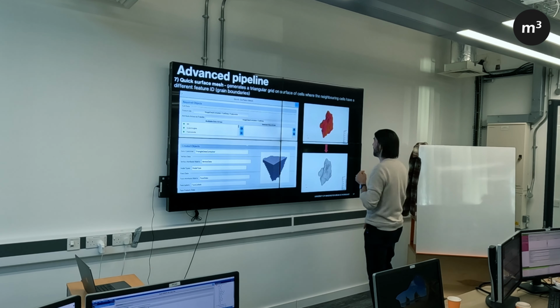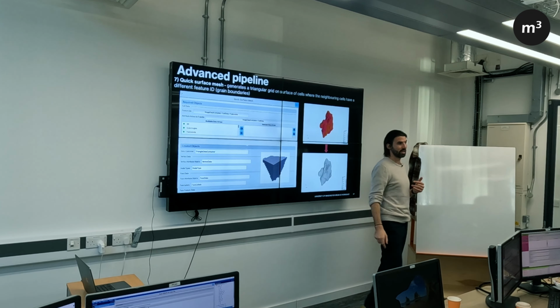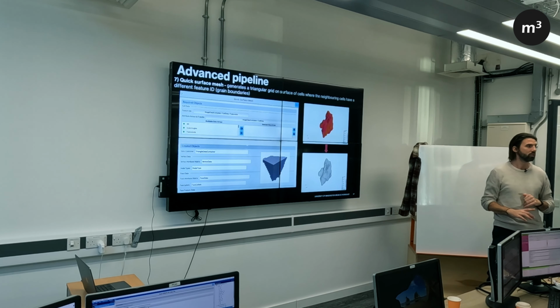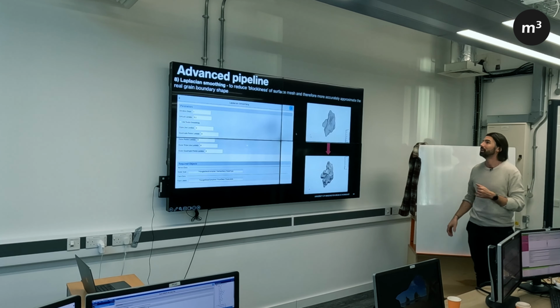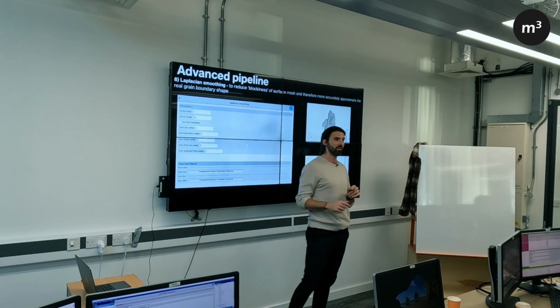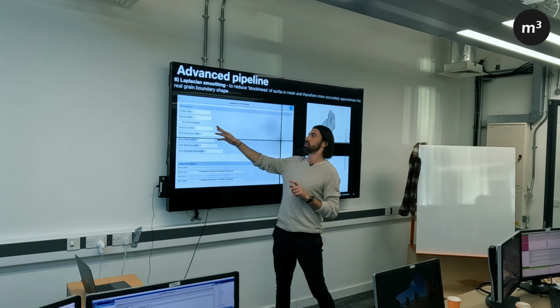And here's an example of a surface mesh on voxelated data. You'll see it doesn't look any different. That's not surprising because it's just a meshed surface on your voxelated data. But now, because we have this surface mesh with this triangular structure, we can do a smoothing function, which is called, don't ask me why, Laplacian smoothing. Don't ask me what all these parameters mean, I've only ever really used the defaults. I increased the iteration steps quite a bit.